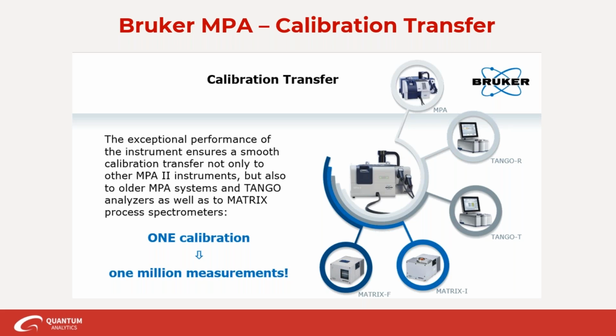With these things, with any type of FT instrument, you can literally transfer any type of calibration that you use to any other type of spectrometer. The important thing to note with that is that you can build your calibrations in your laboratory. You can sit in your cool, air-conditioned, temperature-controlled laboratory, build your calibration with your samples, and then when you're ready to start doing your process monitoring, you can take those calibrations and transfer them to the process instrument.